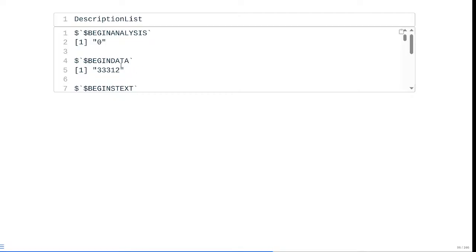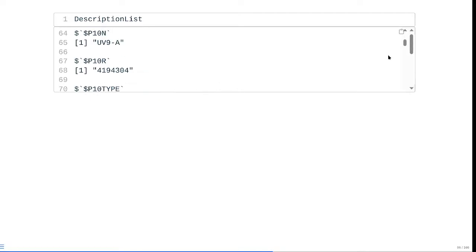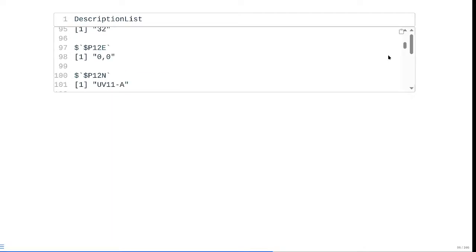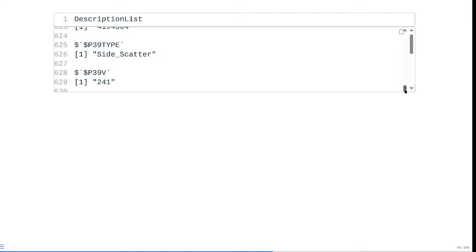And sure enough, it forms. Let me see if I can actually scroll all the way down. Yeah, I can start scrolling. My monitor's not liking this. Yeah, all the way down. So it's a very large list that we're not going to be able to work with directly. So at least we have the values out. We can then deal with them individually as we go.